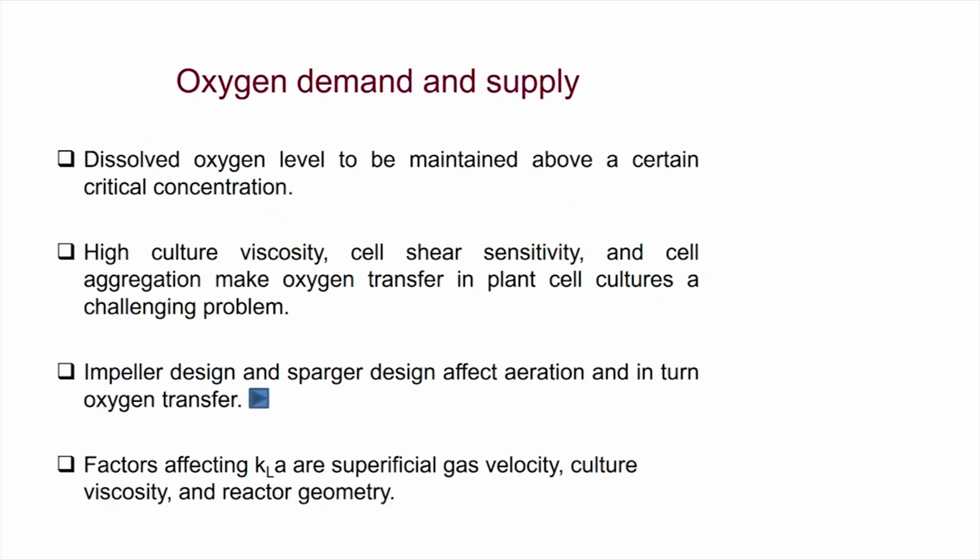In pneumatically agitated reactors, mixing is a limitation, but obviously because there are no moving parts, shear rates are less. What is a pneumatically agitated reactor? Pneumatically agitated means air driven, there are no moving parts. Whatever mixing is provided is provided by the airflow rate, sparging. So dissolved oxygen levels should be maintained above the critical oxygen concentration.